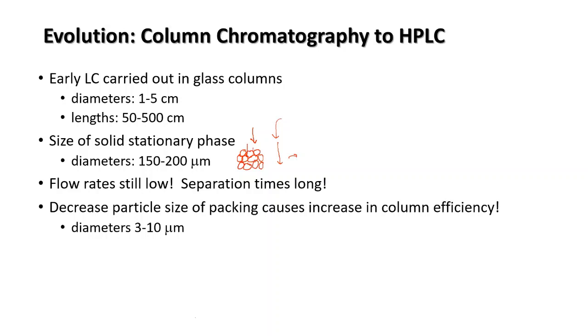What we see is that you are increasing the particle surface area. And if you have more surface area, then your compounds get more chances to interact with the particle surface. It is nicely interacting, so the movement of the compounds will be in a more ordered way. So your separation will be nicer.